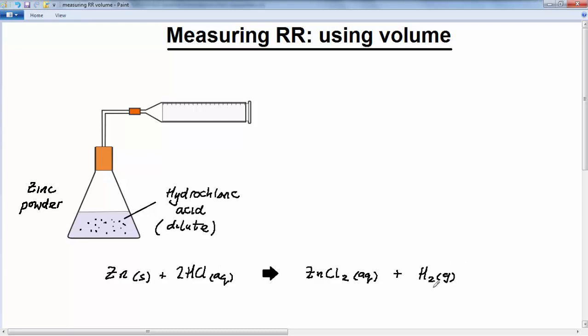So what we're doing in this reaction is we're measuring the rate at which hydrogen gas is released into this gas syringe. So we've got a gas syringe.